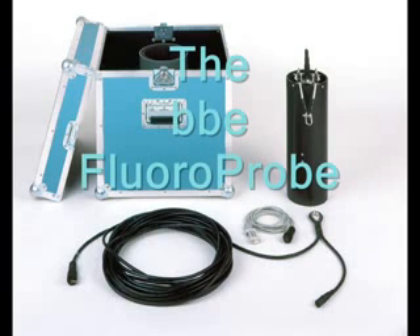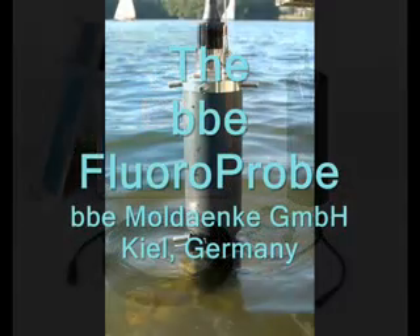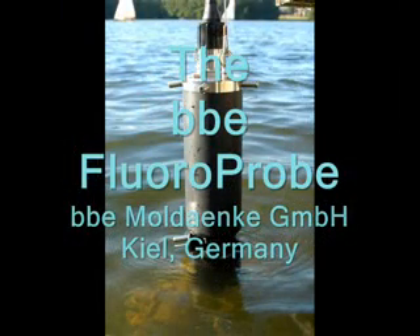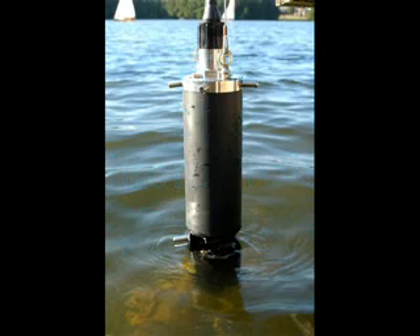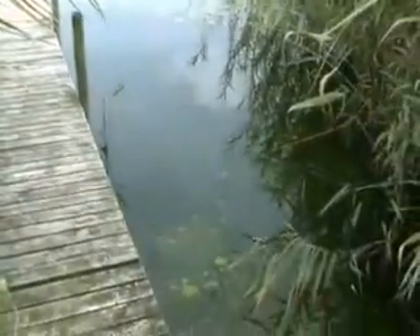The BBE fluoroprobe is a submersible spectrofluorometer with automatic algae class determination and chlorophyll analysis. It determines concentrations of up to five algae classes directly in the water. The standard device measures from the surface down to depths of 100 meters, with an option available which increases this depth to 1000 meters.